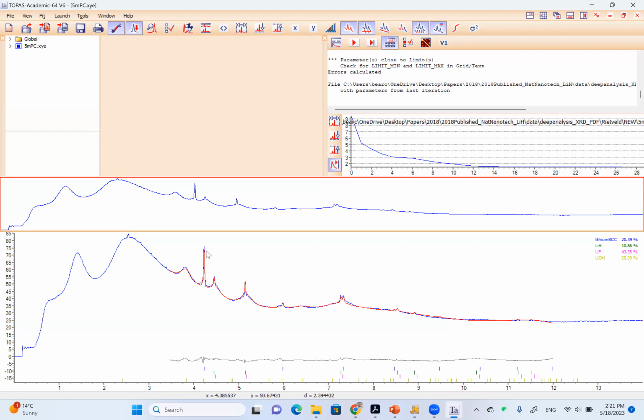One thing is you see the peaks are weak. They have comparable intensity with the background. That's very tricky. The second thing is you do see the peaks have very diverse properties. Some of them are pretty sharp, right? So we have very sharp peaks. We also have those broad guys. You see these very broad peaks, somewhere here, somewhere here, somewhere here. It's a mixture of both sharp and broad peaks, which means one thing: they must belong to different phases, right?